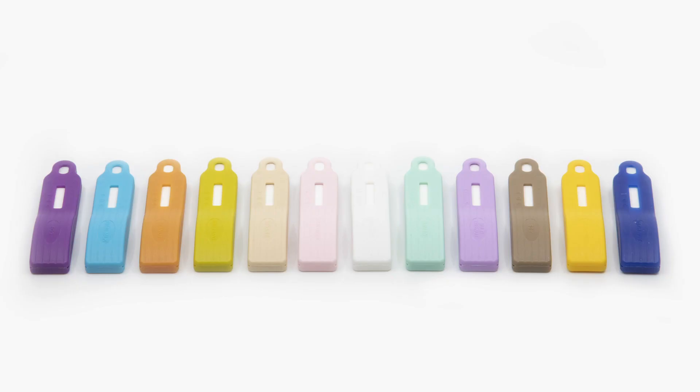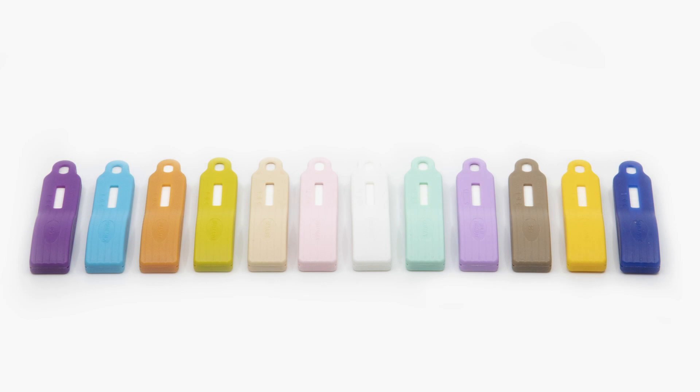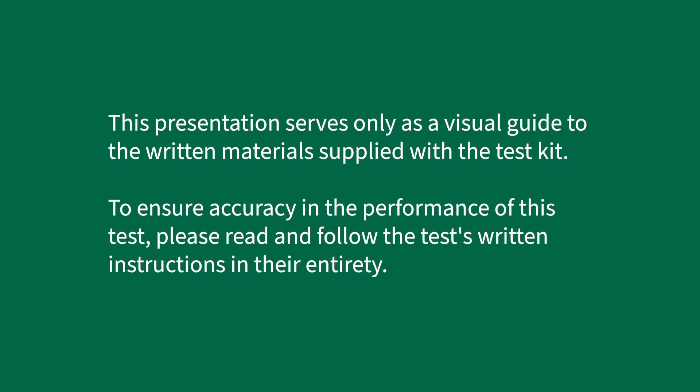This video provides an overview of the proper use of Neogen's Reveal 3D allergen test kits by demonstrating the Reveal 3D for peanut test kit. Test procedures and materials for other Reveal 3D allergen tests may vary somewhat. Please consult the product kit insert for further details. This presentation serves only as a visual guide to the written materials supplied with the test kit. To ensure accuracy, please read and follow the test's written instructions in their entirety.